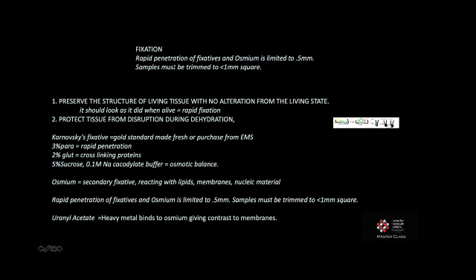And that's not just rapid of putting the fix on, but the chemical reaction of the fixatives infiltrating the cells. Mitochondria, for example, are very, very susceptible to any sorts of environmental changes. So if you're studying the appearance, morphology, or interactions of mitochondria, say with ER, then fixation needs to be addressed very, very carefully.